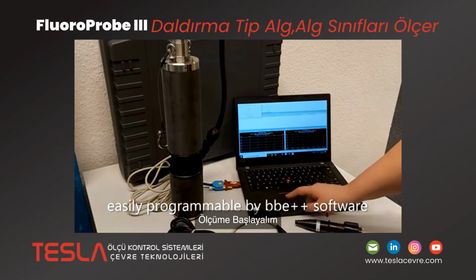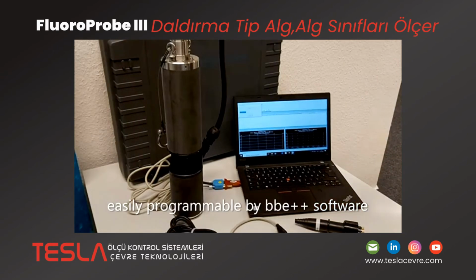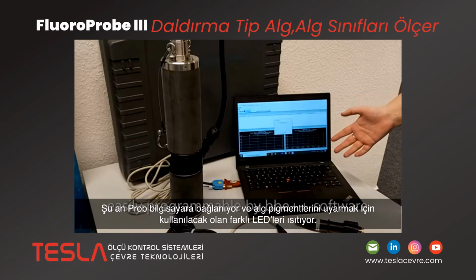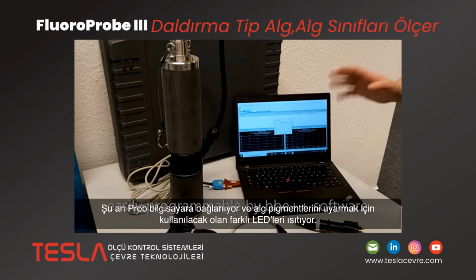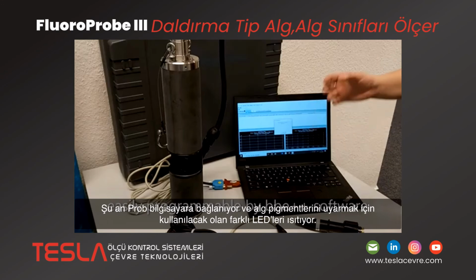Starting the measurement. So what I'm doing now is I've connected the FluoroProbe to the computer, and we're going to show an example of how the instrument collects data and what that looks like in the software. So right now the instrument is connecting to the computer and it's warming up the different LEDs that are going to be used to excite the algal pigments.